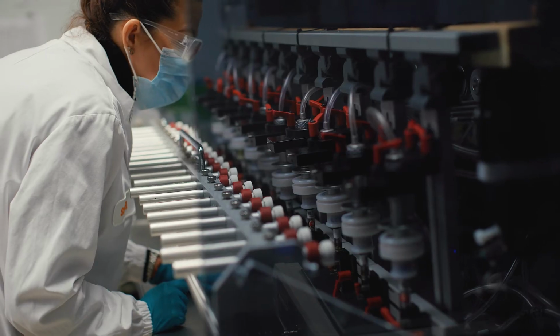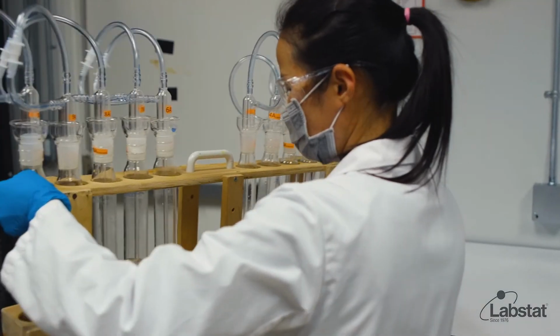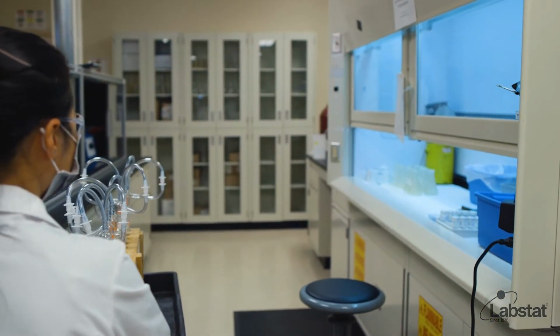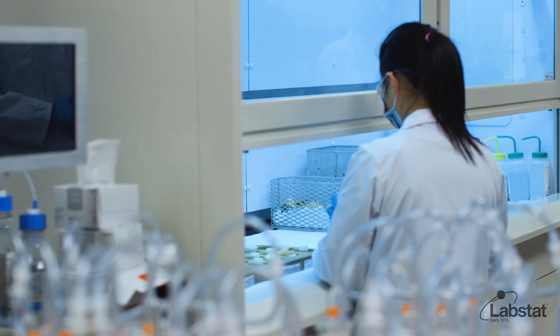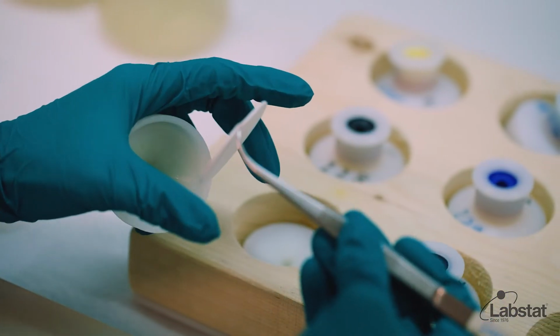Now that the sample generation stage is complete, the technician collects the filter pads and glass impingers and transfers them to another room where they'll undergo further preparation before analysis. These final steps of preparation will be dependent upon the specific analytes the sample is being tested for. The samples we see here are being prepared for targeted analysis of potentially hazardous compounds.